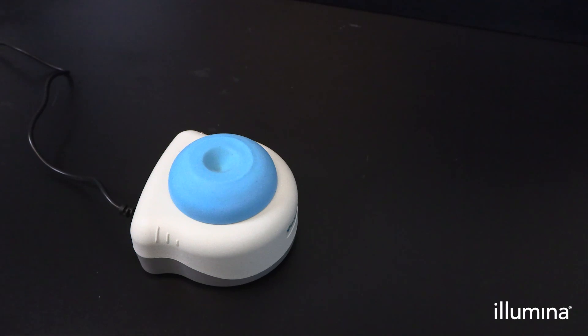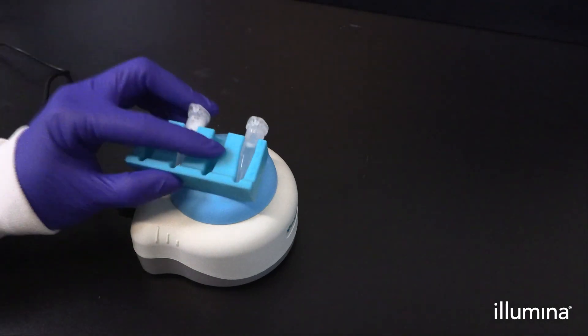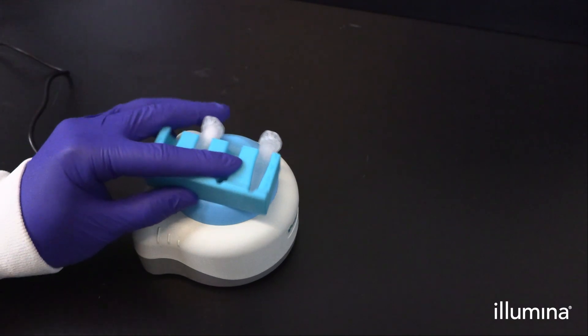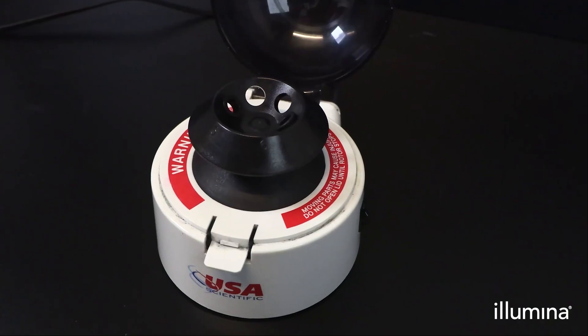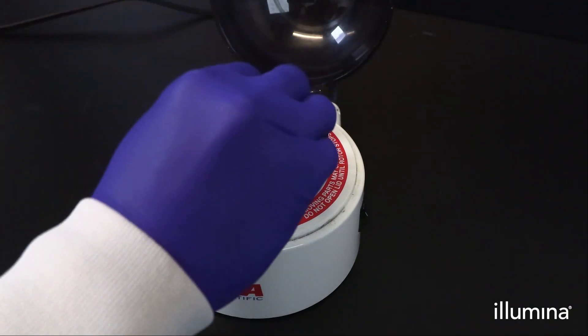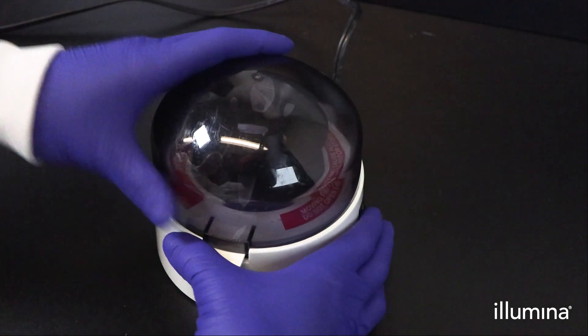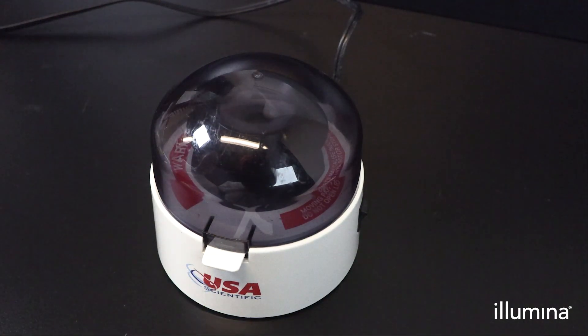Vortex mix pips using the blue 1.5 mil tube stand by holding the stand horizontally on a flathead vortex mixer for three seconds. Centrifuge the 1.5 mil tubes of wash pips for one minute on a benchtop minifuge. Gently place the 1.5 mil tubes of wash pips into the 1.5 mil stand to aid in supernatant removal.